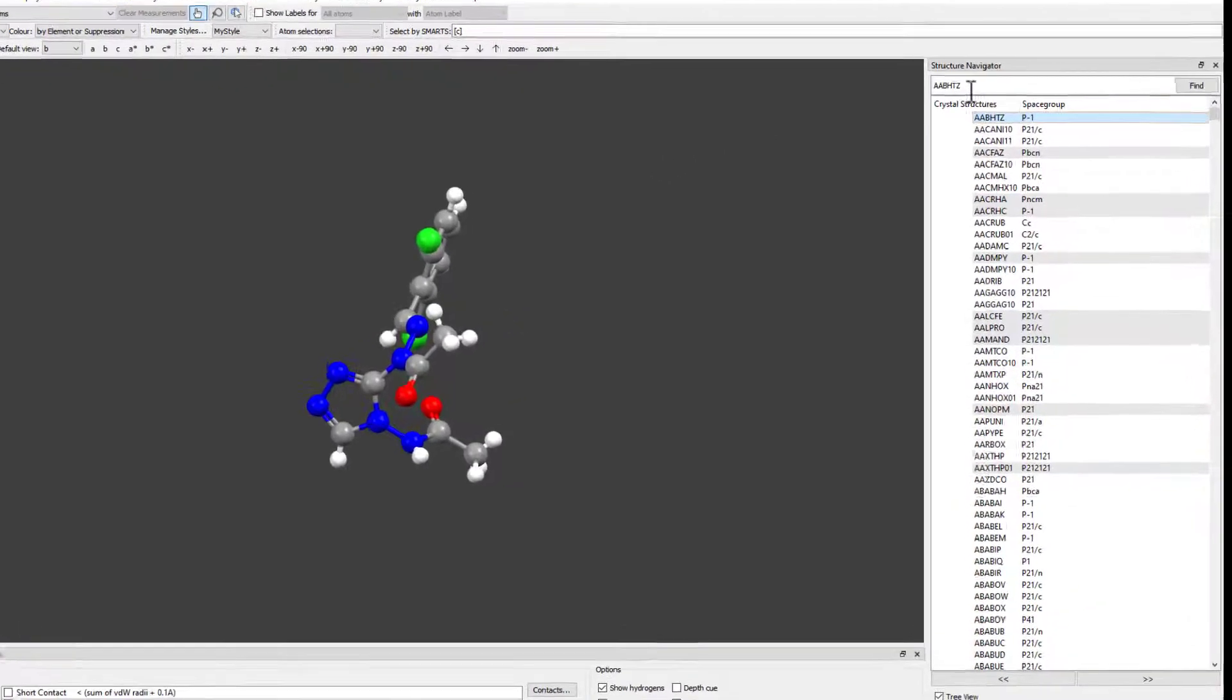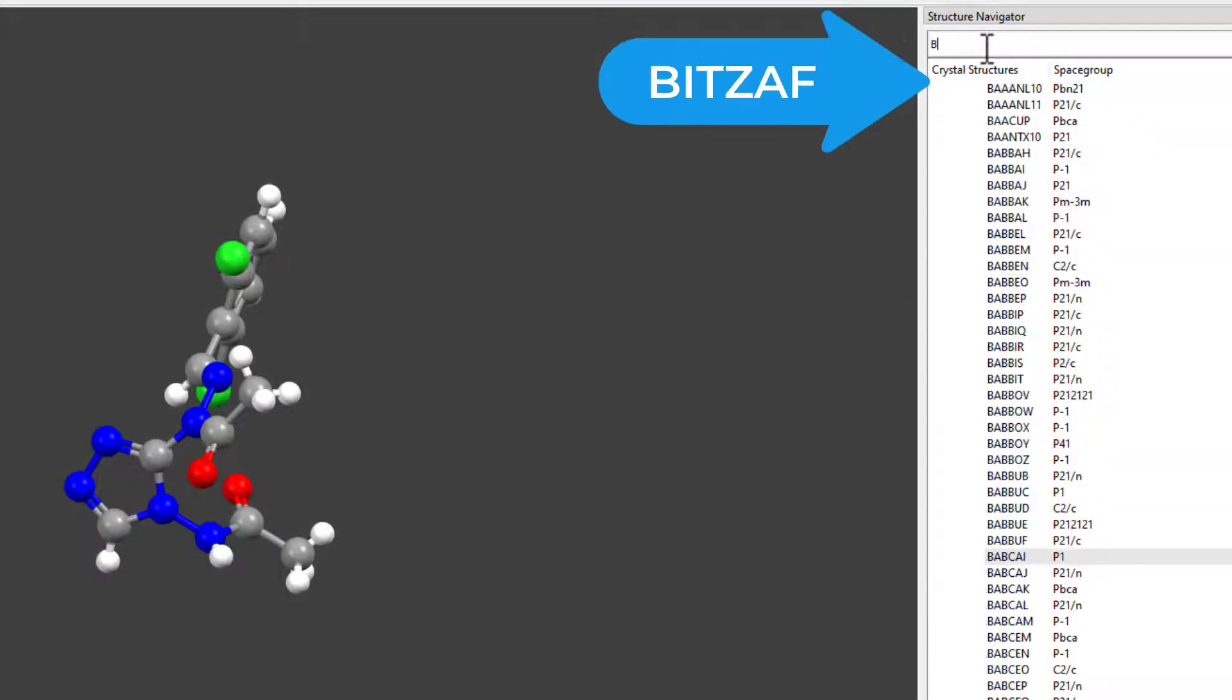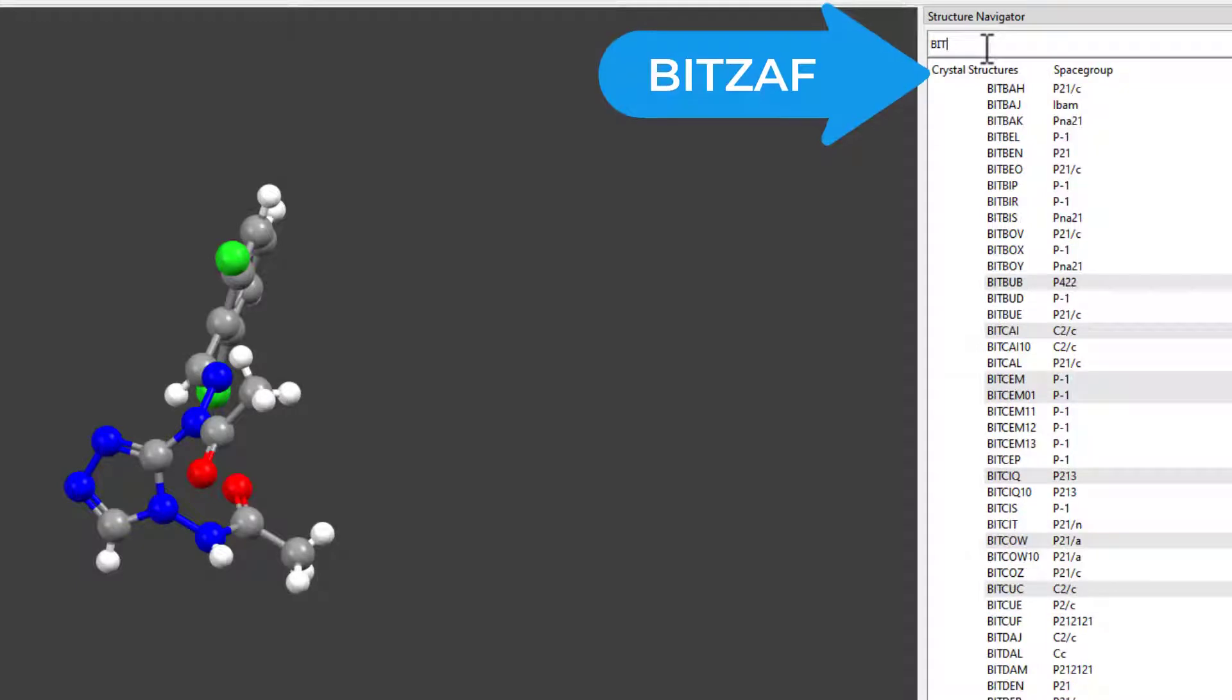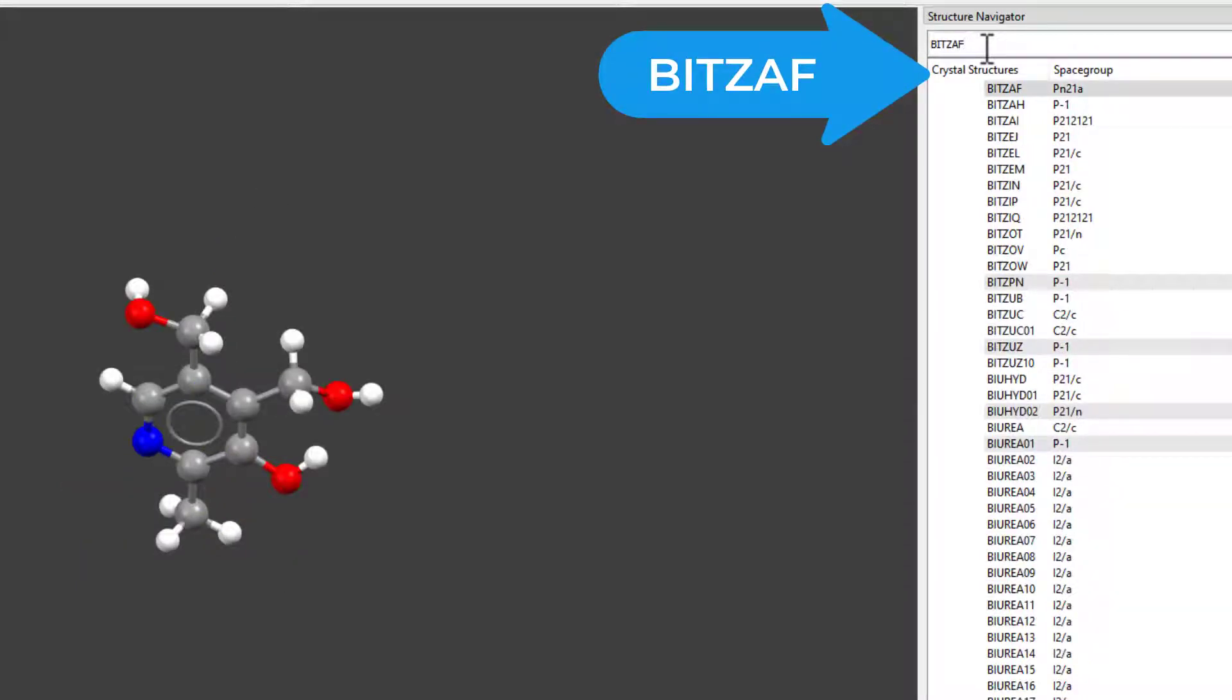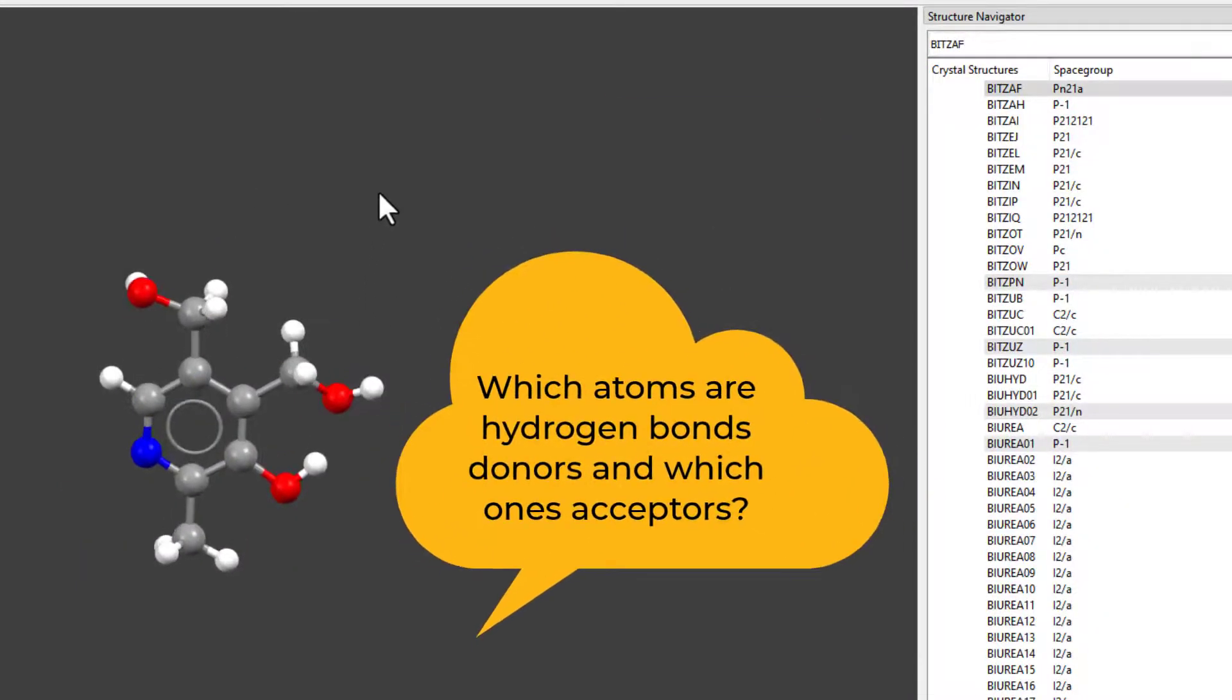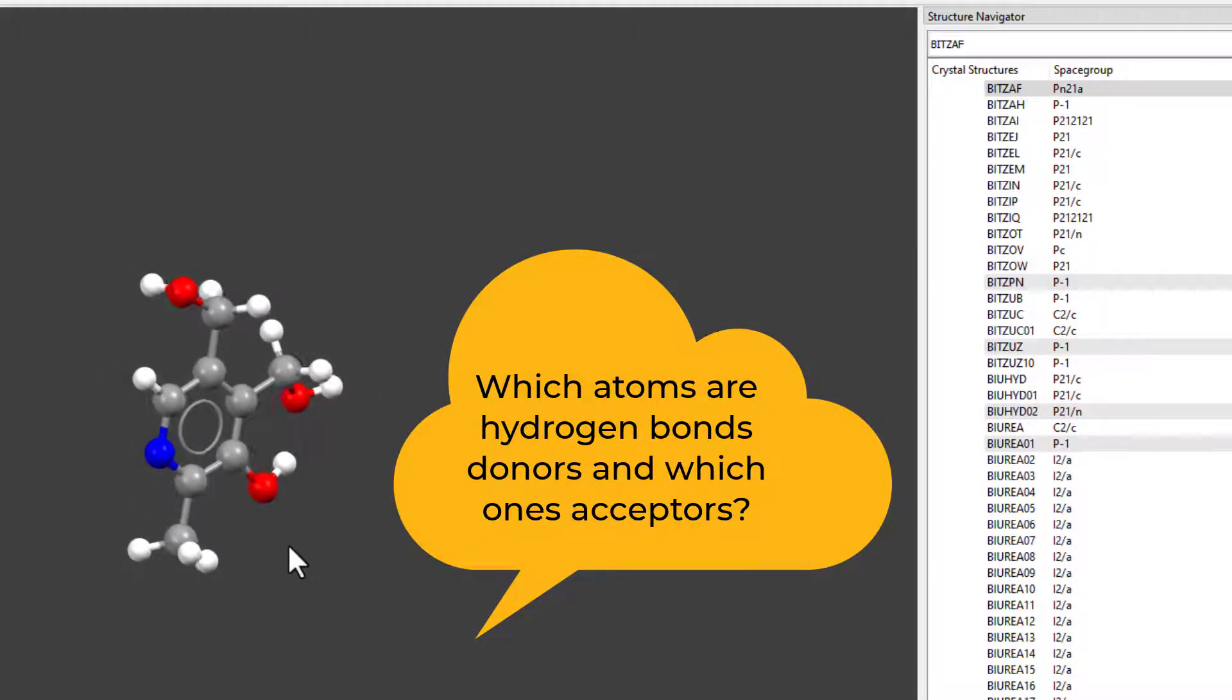To bring up the structure, we will type its REFCODE into the Structure Navigator pane on the right-hand side: V-I-T-Z-A-F. Can you predict which atoms are hydrogen bond donors and which ones are acceptors?